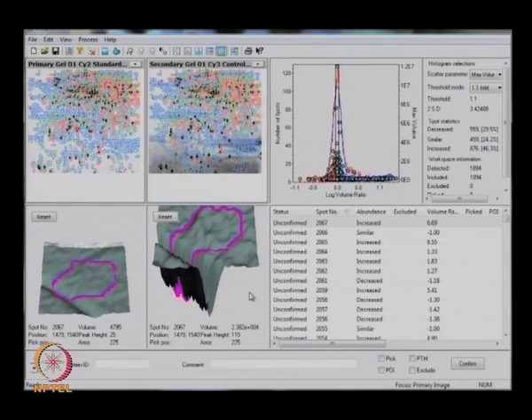That means there are 3 channels, Cy2, Cy3, Cy5. Out of these 3 channels, in the Cy2 image it creates a particular volume, and the same area can be applicable for the remaining 2 gels also. This is the way it works. In this way quantitative and qualitative results are much more accurate than with a single detection. In DIA, each image is co-detected with its internal control, producing 2 image pairs. The ratio to the standard sample is calculated for each protein in each image.